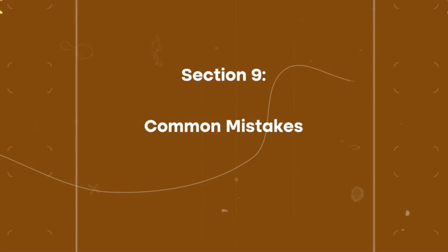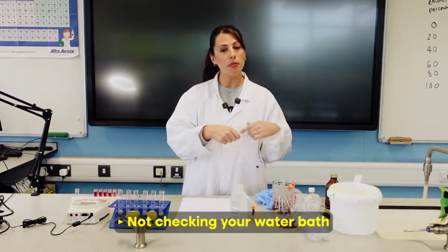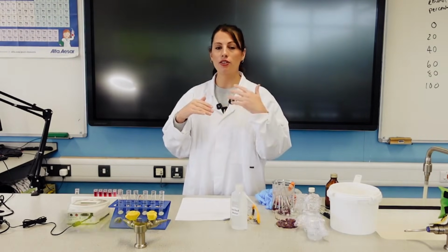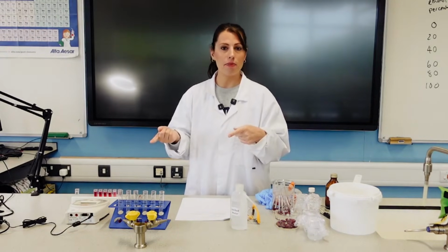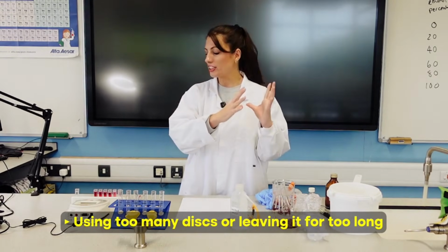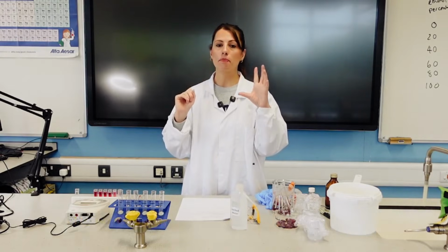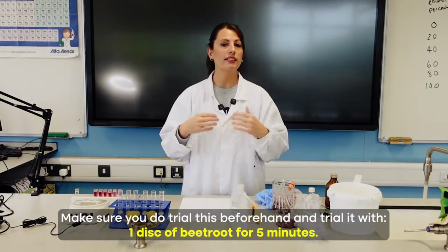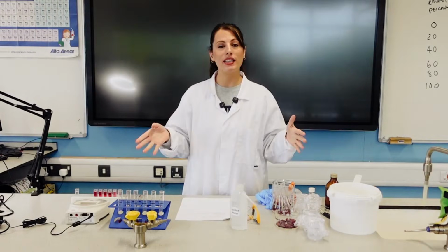Now, common mistakes is basically not doing those things. So not cutting to the same size, not checking your water bath to make sure it is at the correct temperature, not increasing the temperature if you need to. And then actually, I'd say a mistake that we saw here in me doing it was using too many discs or leaving for too long so that you get so much pigment coming out that you can't distinguish between the absorption. So make sure you do trial this beforehand and maybe trial it with 1 disc, 4 or 5 minutes. But that is it for this experiment.